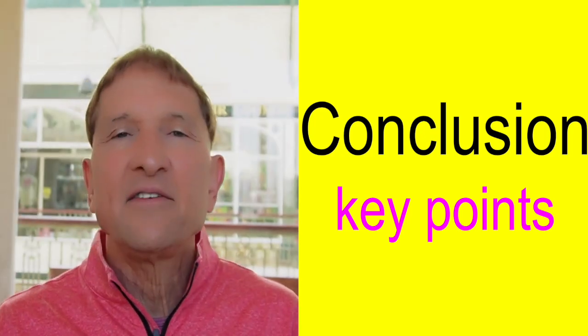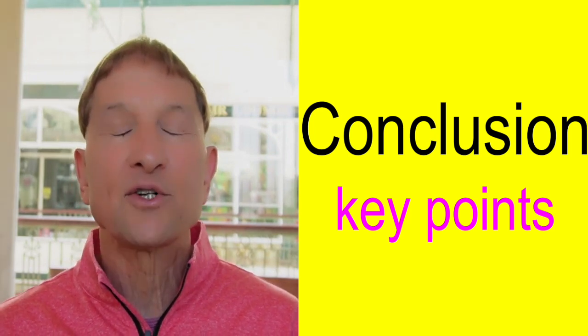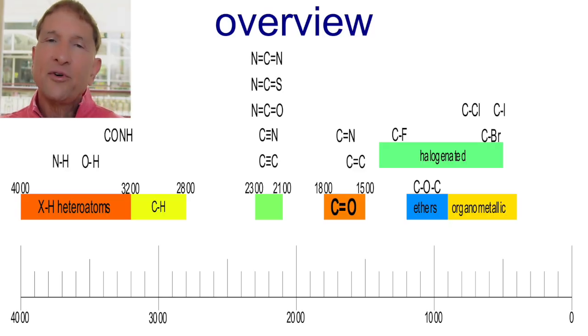So this is the key for making interpretation of IR spectra fun. First, understand how wave numbers relate to atomic masses and bond strengths. Second, remember a few wave numbers for functional groups in certain compounds. And third, use ChatGPT to simulate IR spectra for you and then practice assigning peaks. All the IR spectra in this video are simulated by ChatGPT.